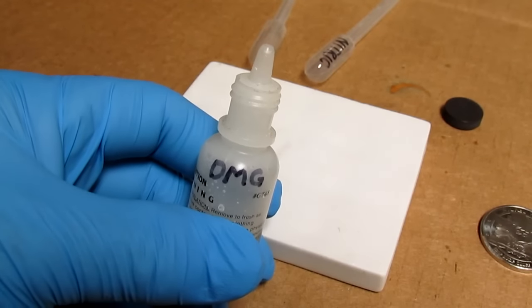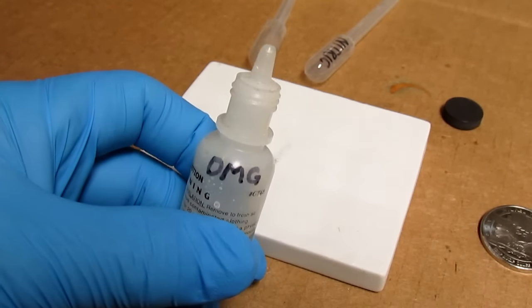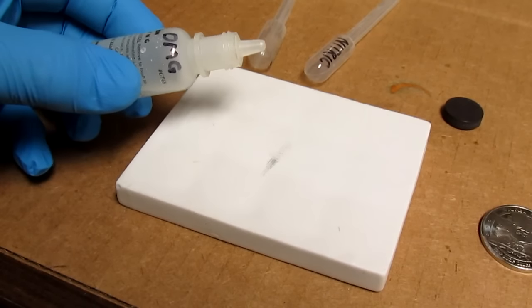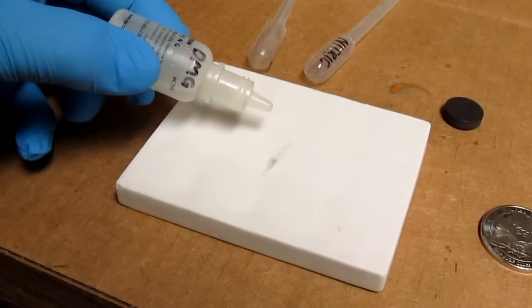Here I have a solution of dimethylglyoxime which is also known as DMG. When I add a drop of this, if we got nickel in solution then it'll turn bright pink.